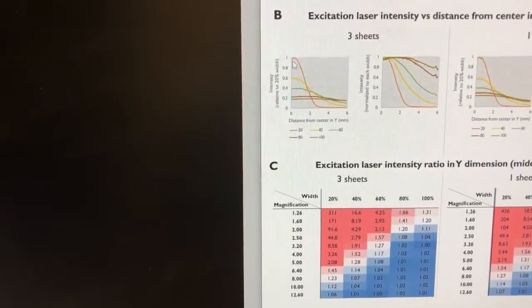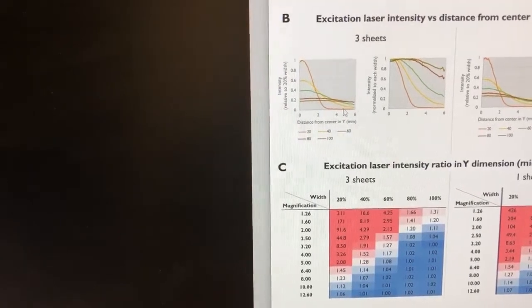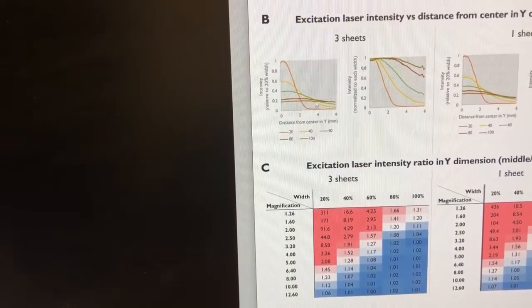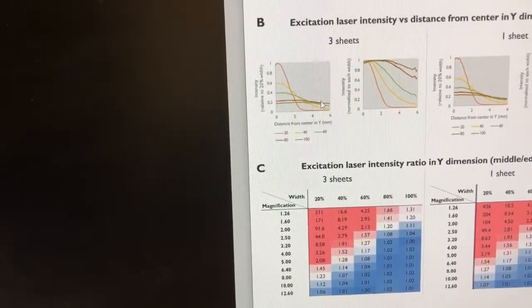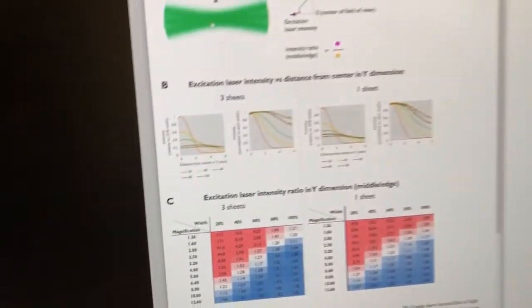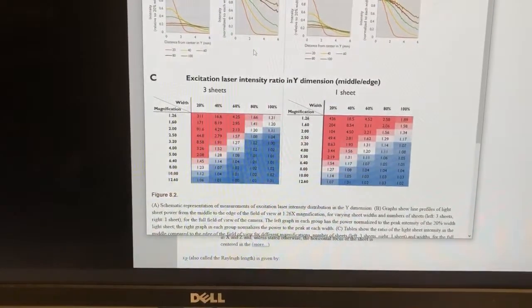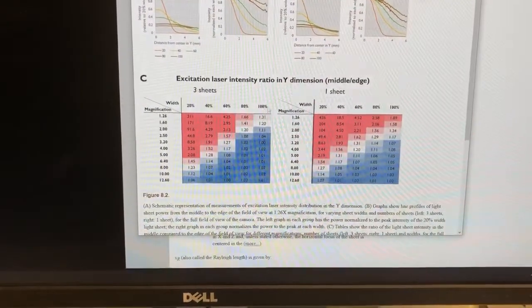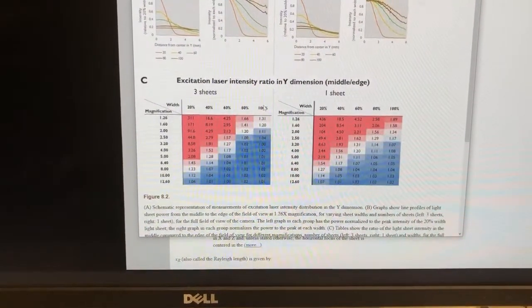And so you can see if the width is low, it's very bright in the middle and then it sort of drops off. But if the width is 100, it's very even throughout. So essentially, if you're very zoomed in, you can get away with a lower width than 100% with still quite even illumination.